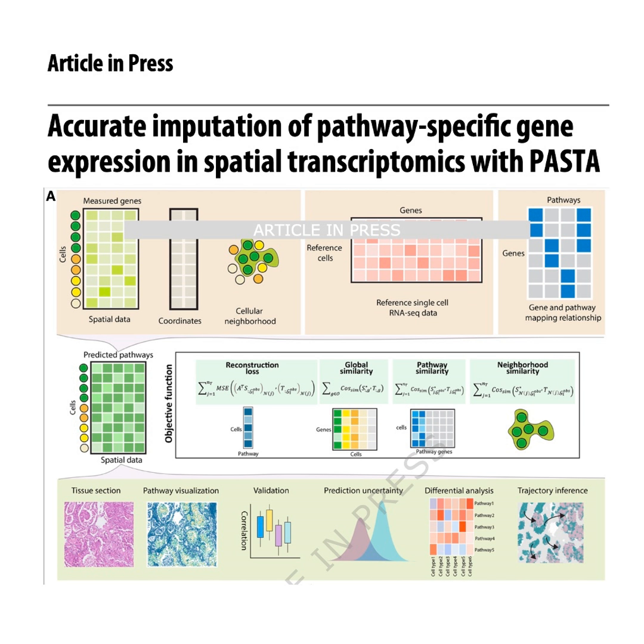For instance, PASTA could successfully distinguish between tumor cells that were located inside a dense infiltration of immune cells versus those in the main tumor core. That's a highly nuanced distinction that is essential for understanding the tumor microenvironment. And this clearer structure also helped with temporal analysis, I believe.